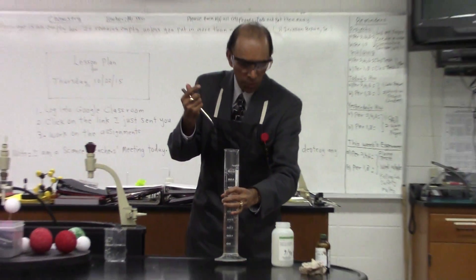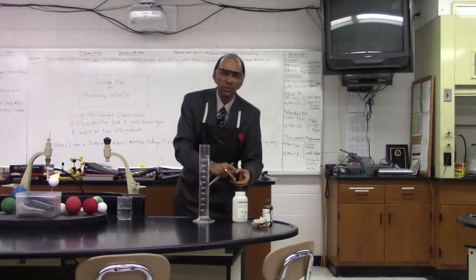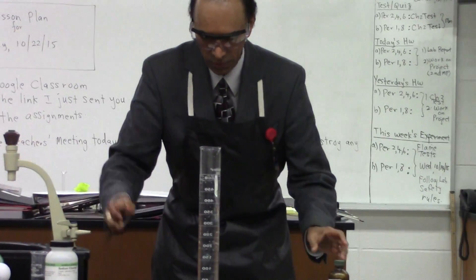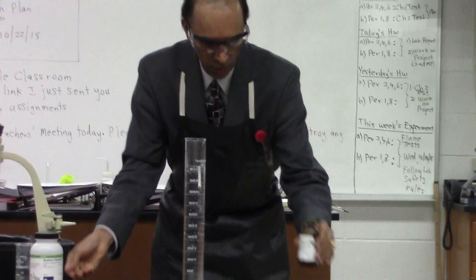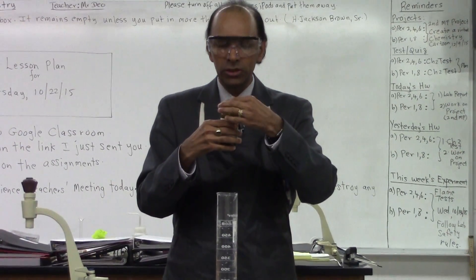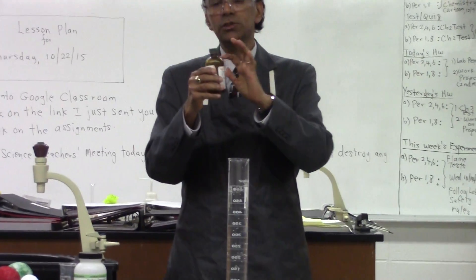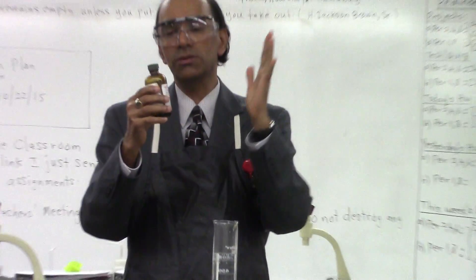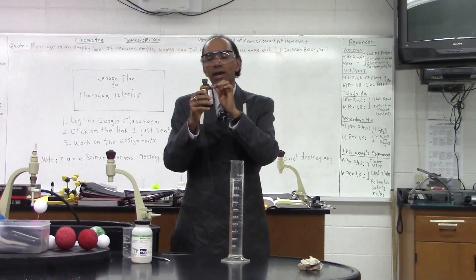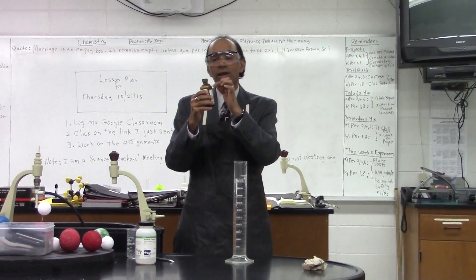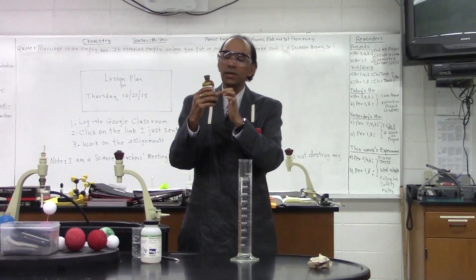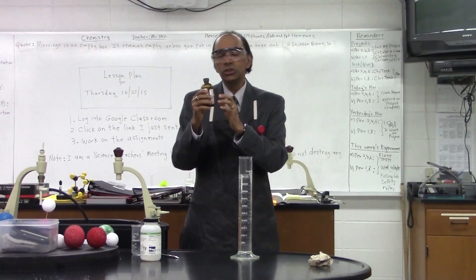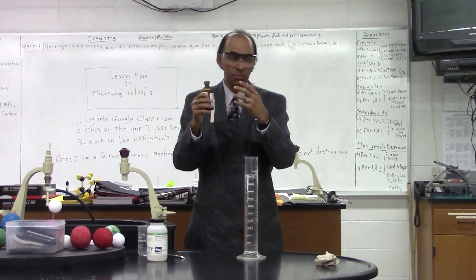But that's not the end of the experiment. I want to add some silver nitrate, and you'll see what's going to happen. Silver nitrate has a formula AgNO3, and it's in a dark bottle. There's a reason why it's in a dark bottle — it keeps out certain wavelengths of light, because if certain wavelengths of light interact with the silver nitrate, it will create what's called a photochemical reaction and actually change the silver nitrate to some other substance.